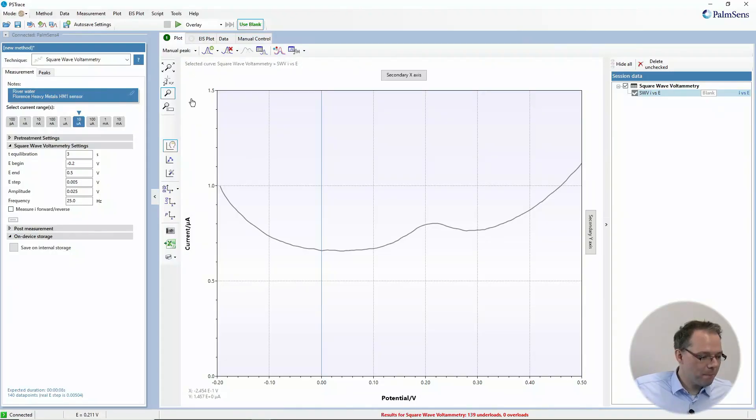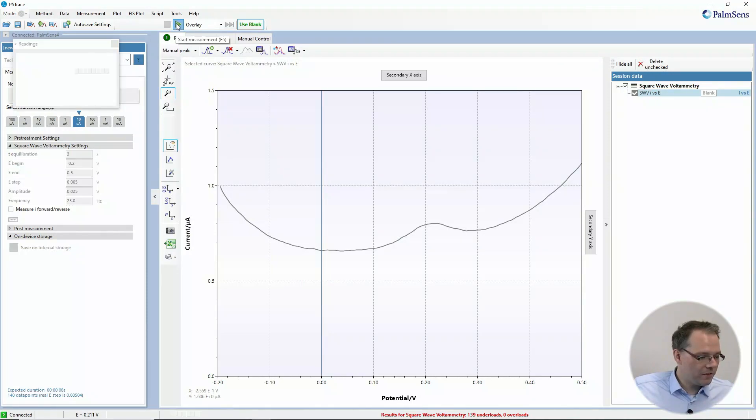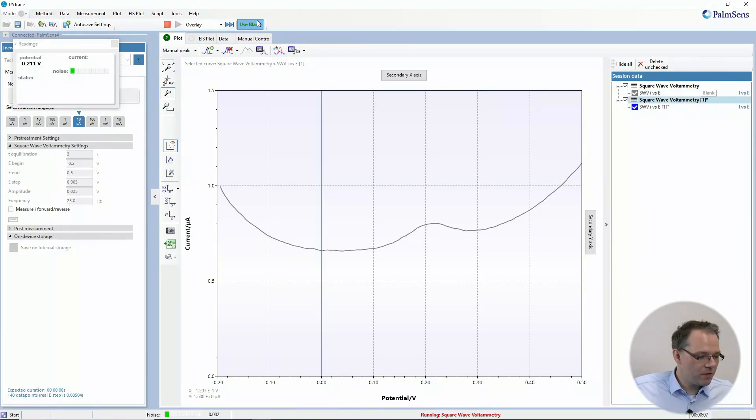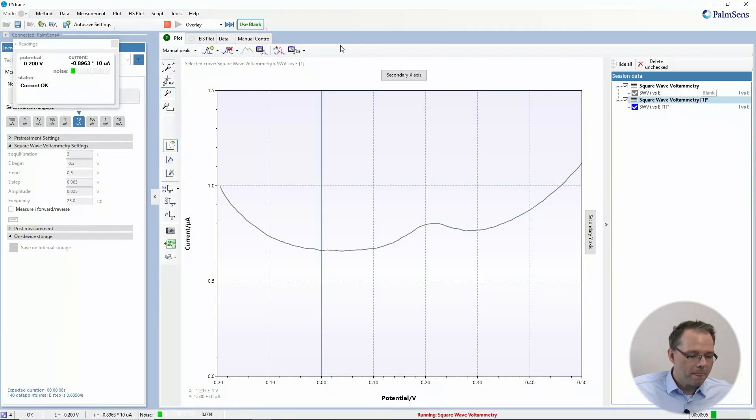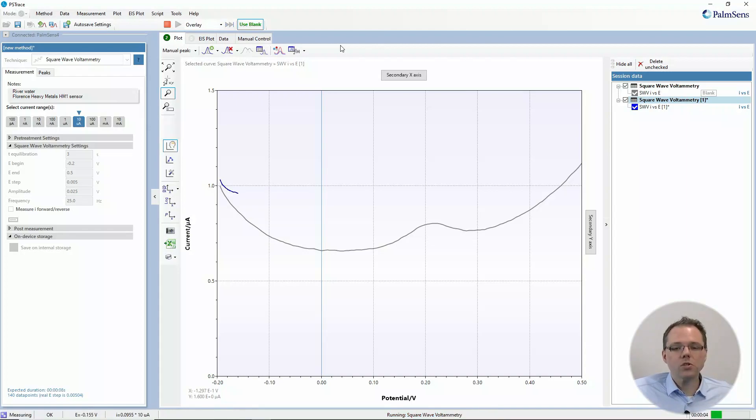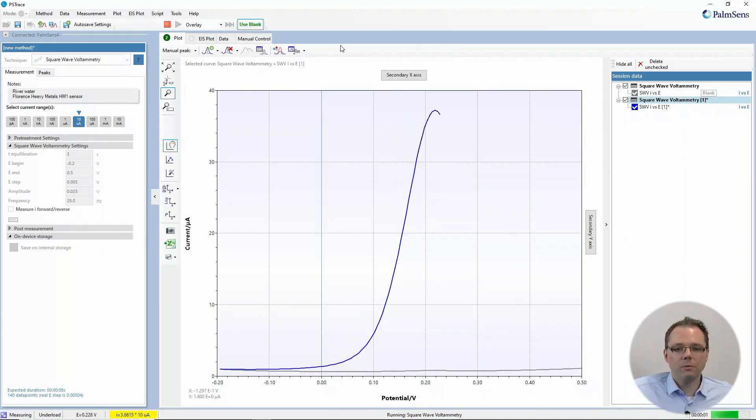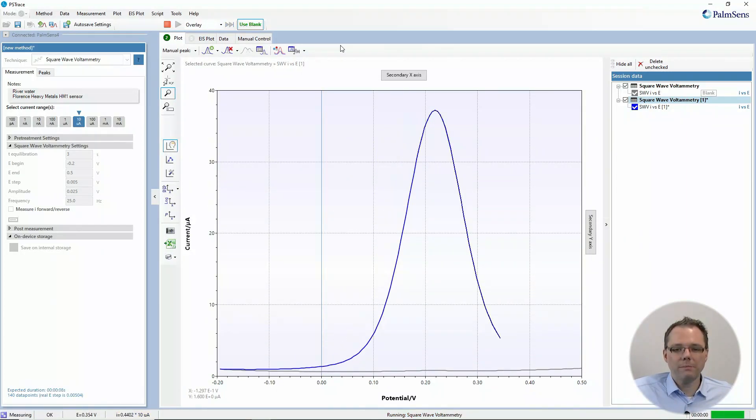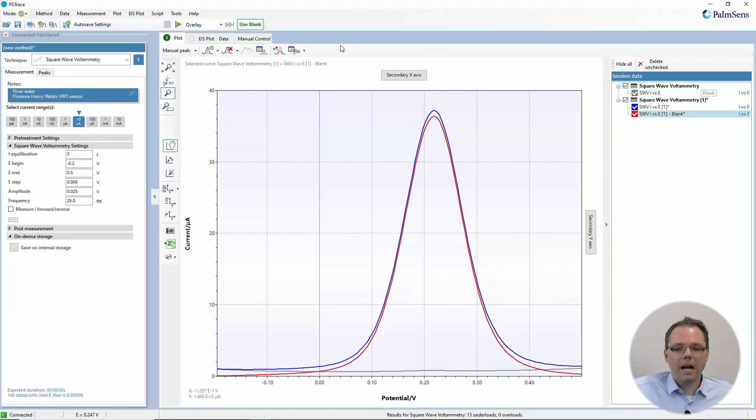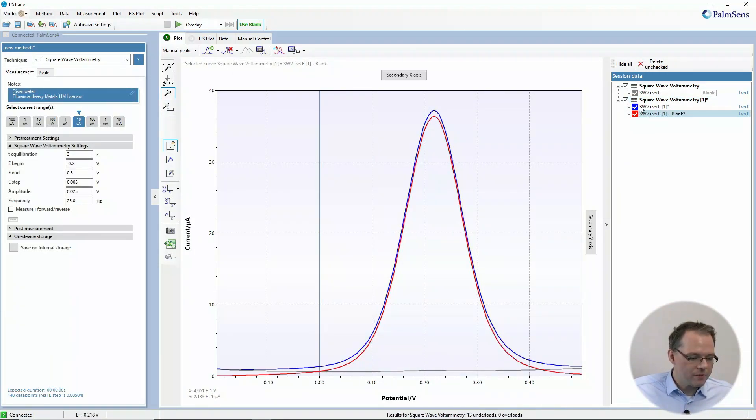Now I will do in PeerTrace the real measurement. I just overlay the real measurement with this button activated. First you will see the real measurement performed, and then you see both of the curves.